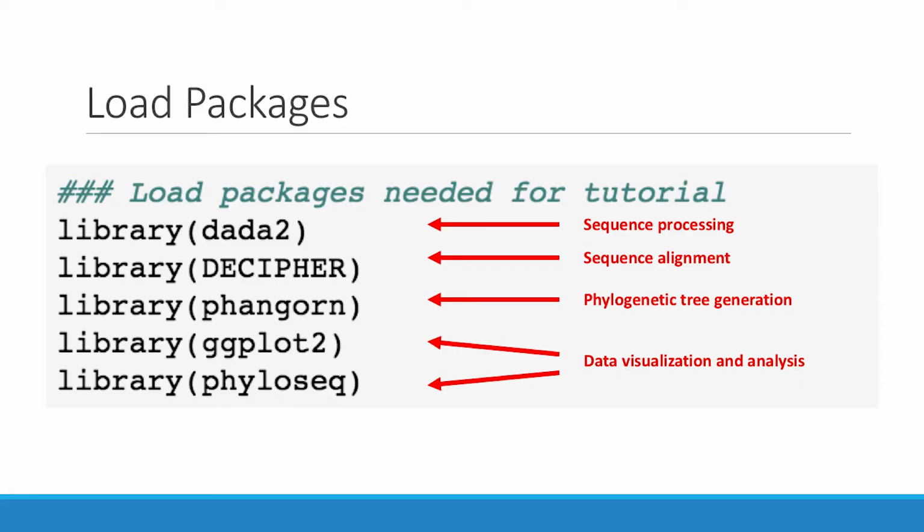So some of these blocks of code I'm not even going to spend more than 10 seconds on, but some of the more intensive and important ones I'll take a little bit more time and explain what's exactly going on. So the first thing you do in R is you load your packages. For this tutorial, you need 5 packages.